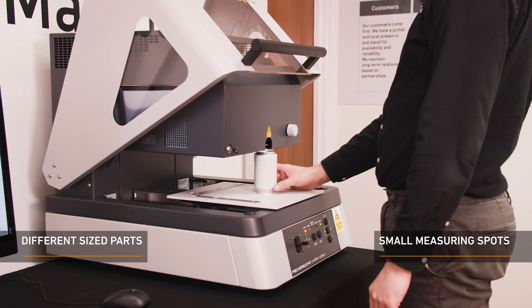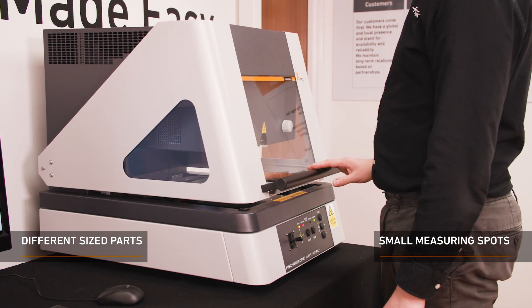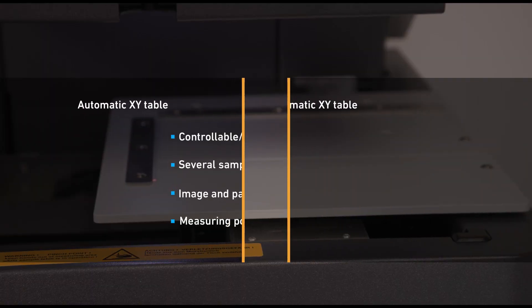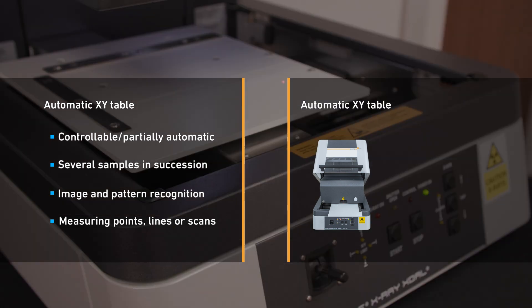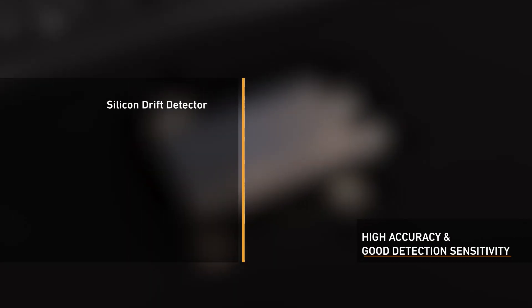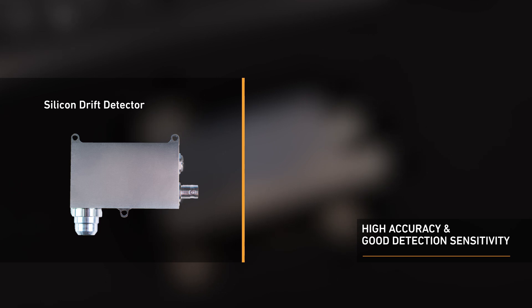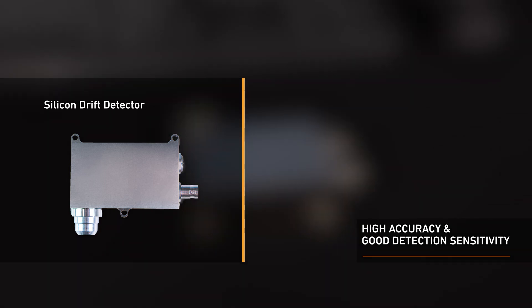It has a high-resolution video camera with zoom to enable easy sample positioning and precise measurement spot adjustment. It has a programmable XY measuring table, image and pattern recognition, and a useful C-slot gap, meaning wider-shaped parts can fit across and into the measuring chamber with ease. The XDAL-237 range benefits from silicon-based detectors, such as the silicon drift detector, with the winning combination of high X-ray energy resolution and X-ray spectrum count rates.